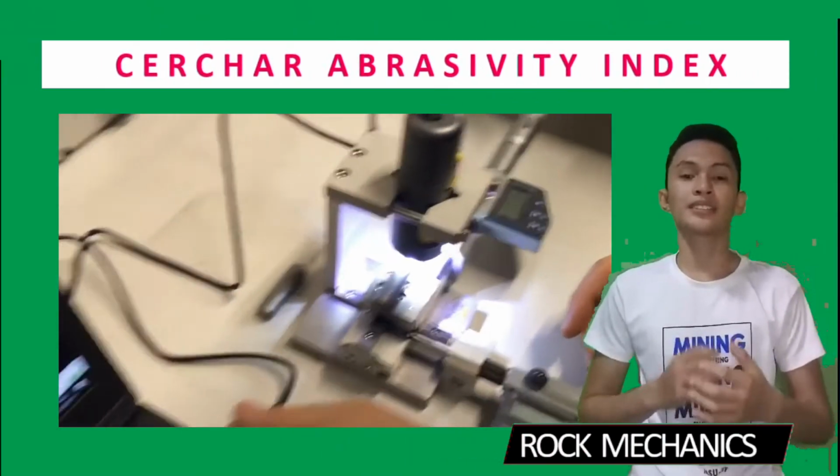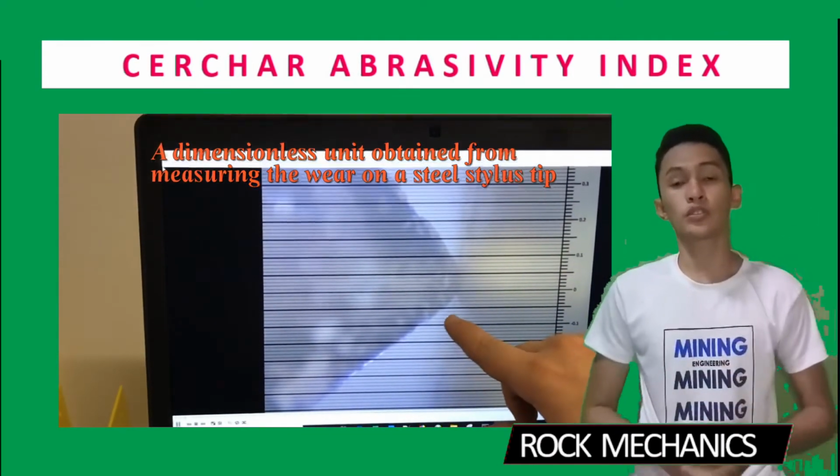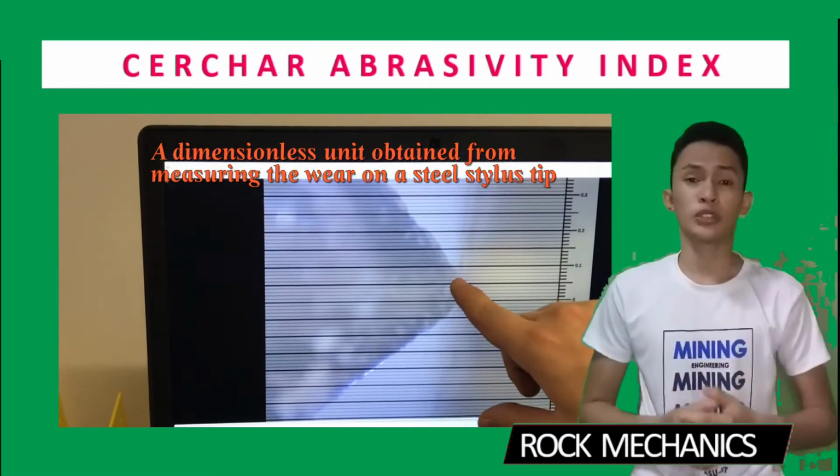Prior to the test, the stylus should be inspected under a microscope. The apparatus should be checked for proper functionality.